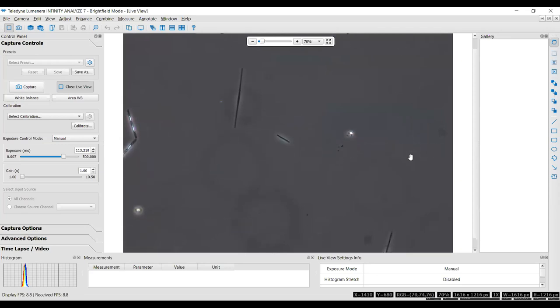Pretty typical of these southwest and southeast reservoirs is Pseudanabaena, and that's what that is. It's easier for me to see the individual cells on my scope, but there's two or three cells in there. And so you would measure the length of the cell and measure the whole thing.